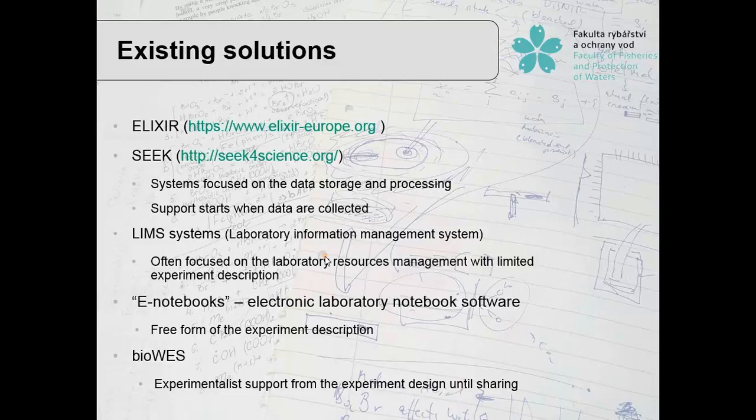Because our solution is not the only solution you can use for data management, I tried to prepare here a list of the possible solutions you can use. Probably you know the Elixir initiative or maybe Seek. These two projects are mainly focused on data storage, data processing, and the support of your work starts when the data are measured and collected, and you can upload your data to Elixir servers and ask for the Elixir services to process the data, use data management tools, and so on.